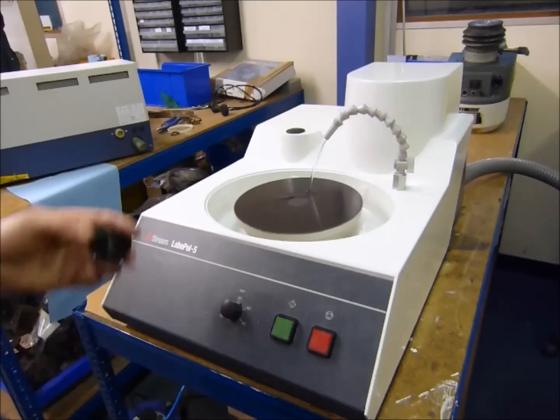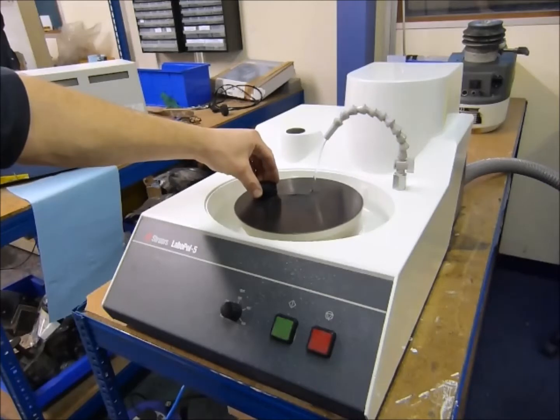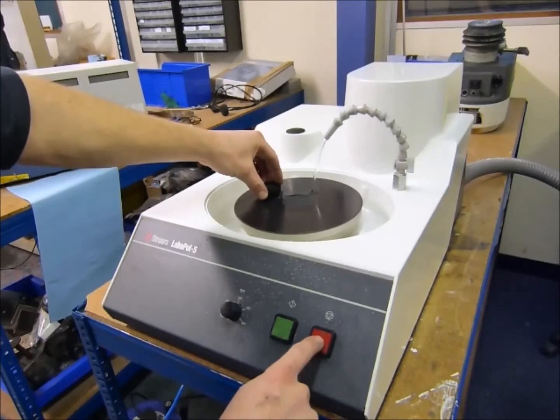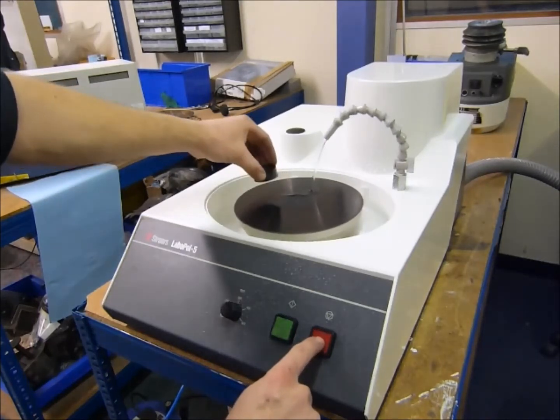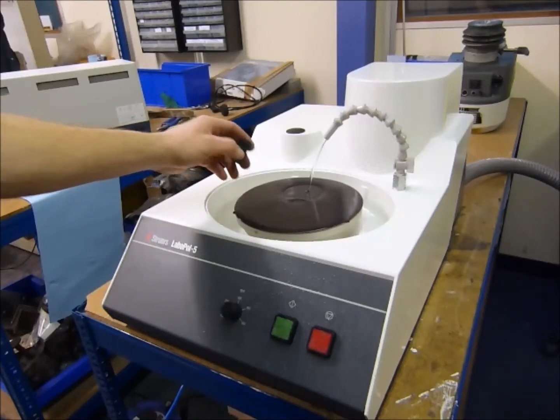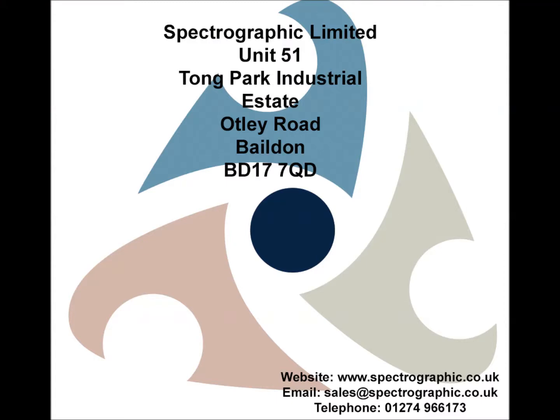Add a little bit of water and then hold your hand full of glass. A little bit of water.